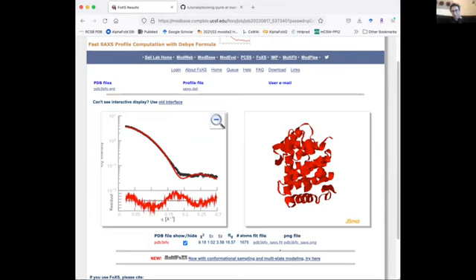Yes, you're right. This is not a great fit. So maybe it looks fine here, but if we zoom in, I don't have a mouse, so it's difficult to zoom in, but trust me, it doesn't fit anywhere. So based on the residual, we can clearly see that it doesn't fit. This should be ideally a straight line. And we have a huge misfit here.